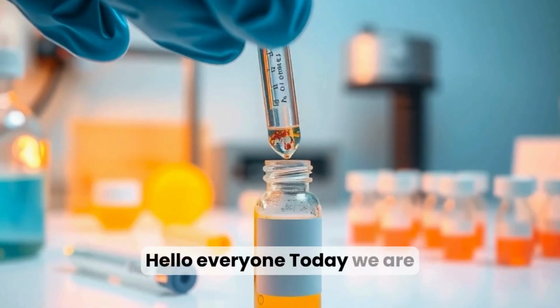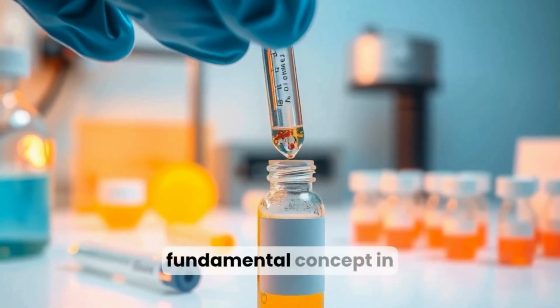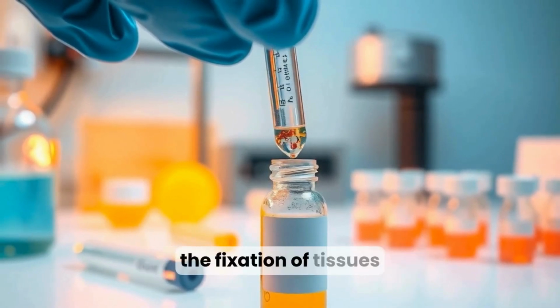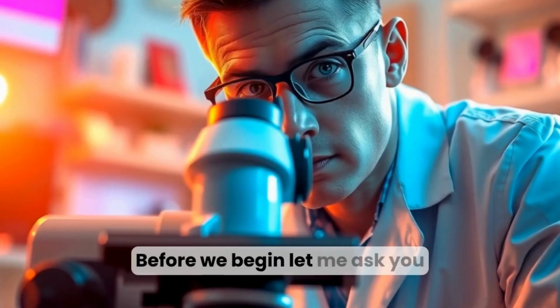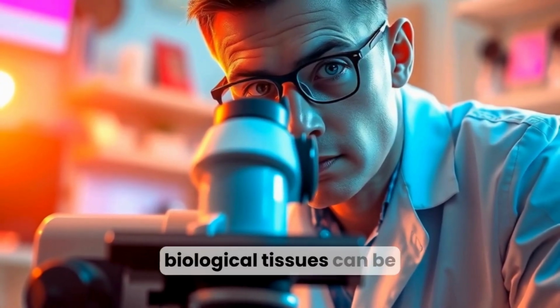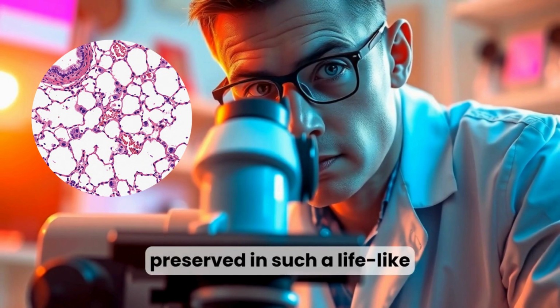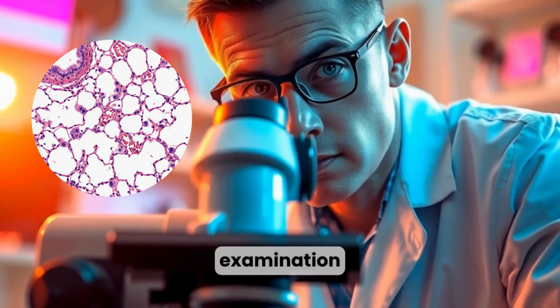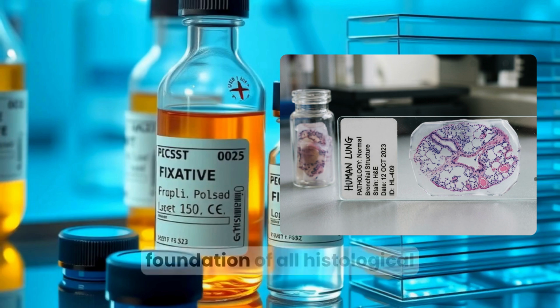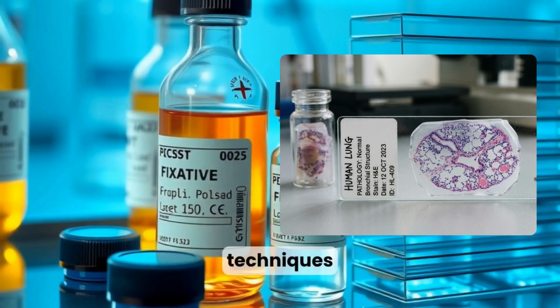Hello everyone! Today we are going to explore a very fundamental concept in histology and cytology, namely the fixation of tissues. Before we begin, let me ask you a simple question. Have you ever wondered how delicate biological tissues can be preserved in such a lifelike state for microscopic examination? The answer lies in the process of fixation, which forms the foundation of all histological techniques.